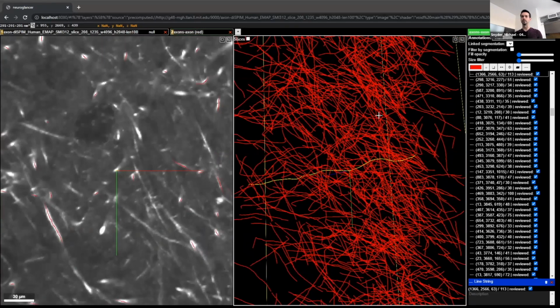And all the same capabilities apply here, where the user can go through and move the control points and add new annotations to the data set as they deem fit. So the current process we're working through is we've open sourced all of our contributions, and we're working through cleaning those up to get them released out onto GitHub and introduce them back into the community for integration with the baseline NeuroTrALE.